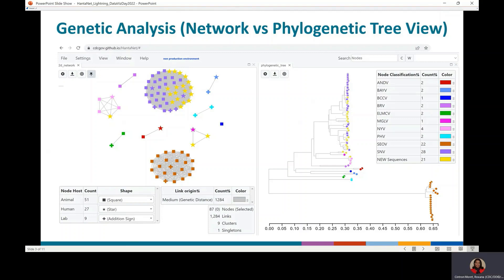Networks are easier to explore because a distance cutoff can be applied to see the differences in formation of genetic clusters. In this case, the cutoff is 0.2. Networks also simplify visualization of gene reassortment, a mechanism for evolution of viruses with segmented genomes.